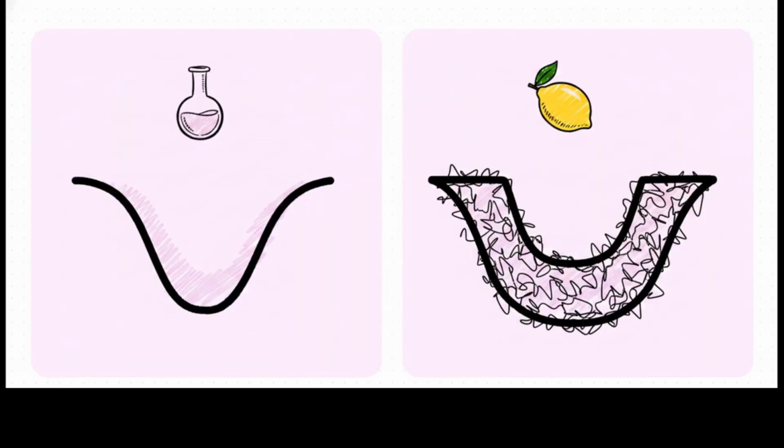Now, what's really fascinating here is how just looking at the broadness of that OH dip instantly tells you if you're dealing with an alcohol or a carboxylic acid. An alcohol OH is like a broad valley between 3230 and 3550. But an acid OH is very broad, stretching all the way from 2500 to 3300. That is wide enough to literally swamp and overlap the entire CH region. So if you see a massive dip hogging all that space, your brain should immediately scream acid.